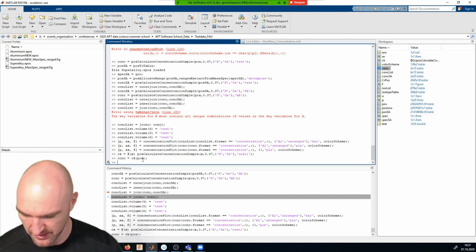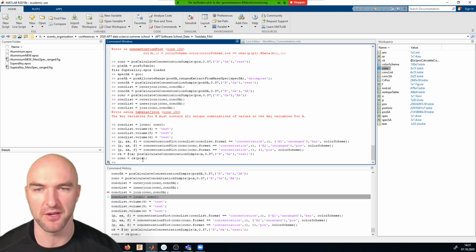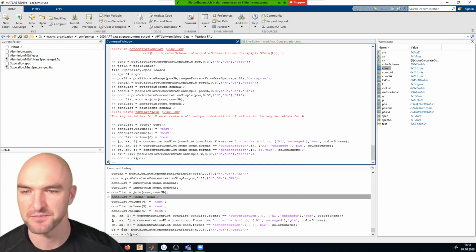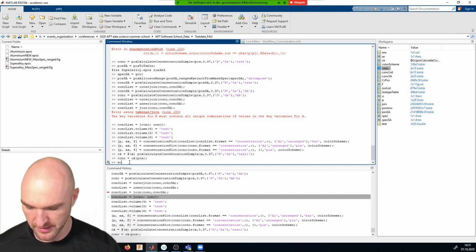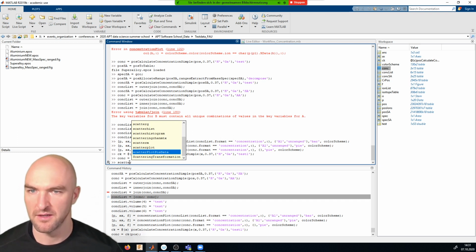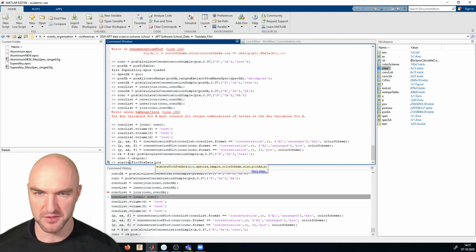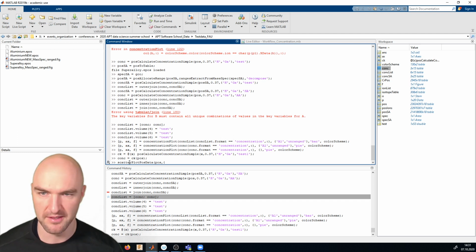Because we already had the functionality to display the mass spectrum, and we haven't yet looked into displaying in 3D. And in order to have a 3D display, we can just use the scatterplot pos data function. And here we want to display our pos file. The species we want to display, in this case, maybe silicon is probably good in something with precipitation in aluminium, silicon.